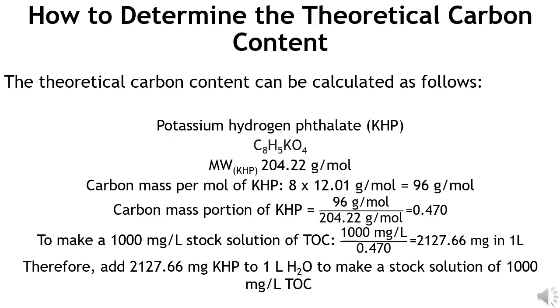How to determine the theoretical carbon content? To calculate the theoretical carbon content, the following parameters should be known: the molecular formula of the compound, the molecular weight of the compound, and the number of carbon atoms in the compound.